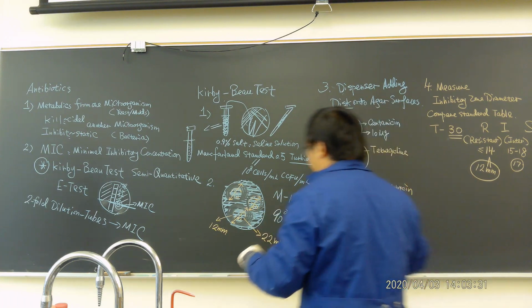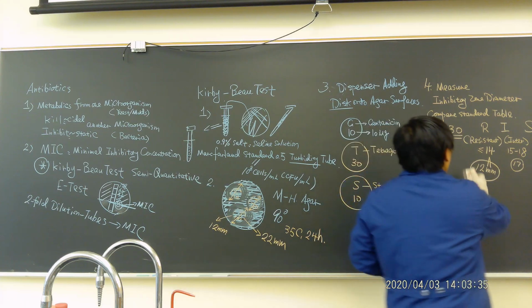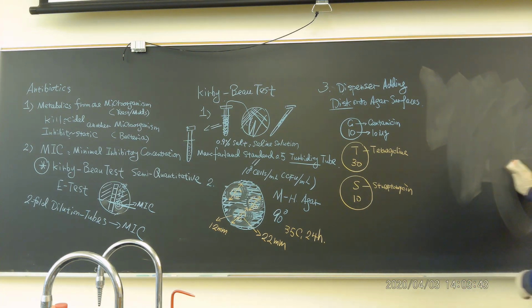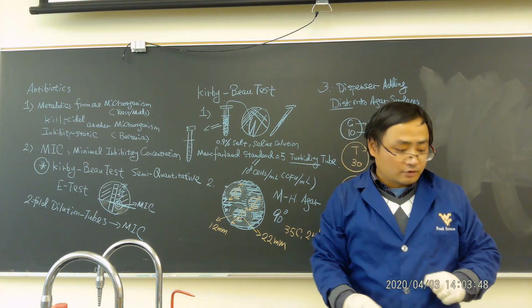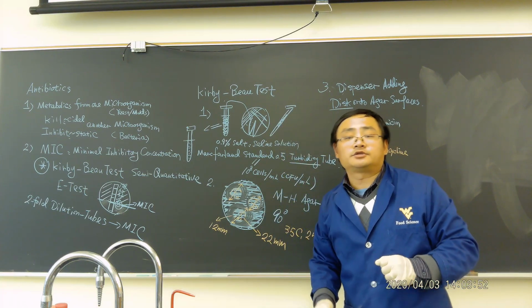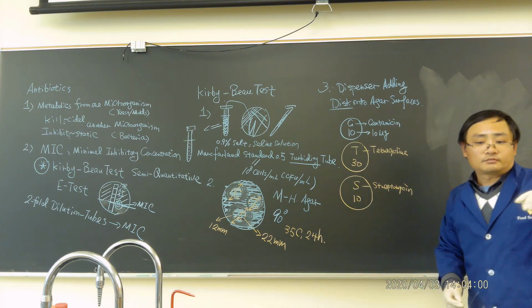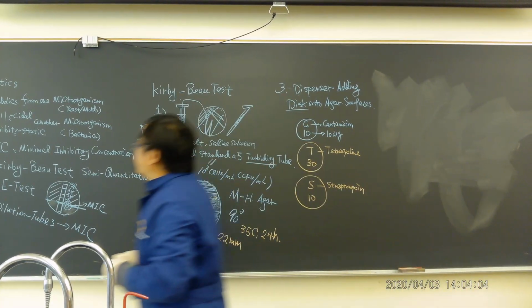So I just wipe this off. We're going to do a second part. I will maybe just put it right here. I want to save some space. I don't have to write everything from the beginning. So I'm going to write here. Can you make sure that one works? If you can come in, Karen, make sure the camera can cover that side. Can move a little bit. So this will be exercise 1.